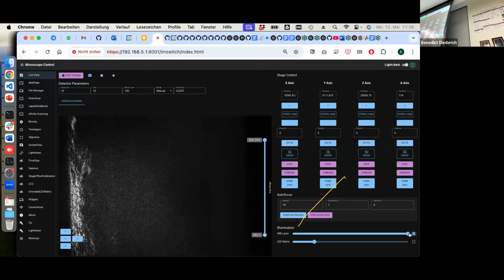Yeah, perfect. I think everybody chooses, or maybe in a group of 2-3 people, so then we have 5 groups. Not a random setup, but something you are interested in, for example a confocal microscope. Look up the diagram, like in any manuscript, even the light path diagram or optics diagram. They'll show you the light paths and where mirrors and things need to be, right? Yeah, exactly.